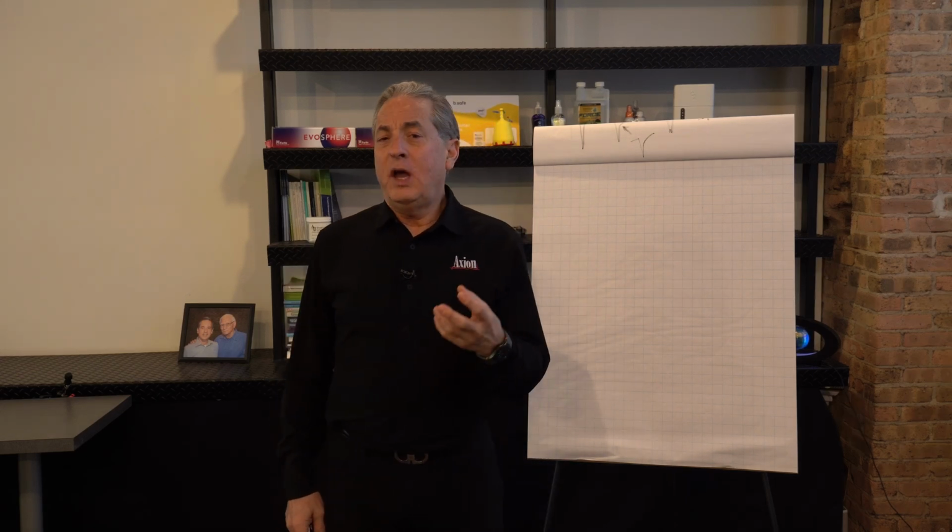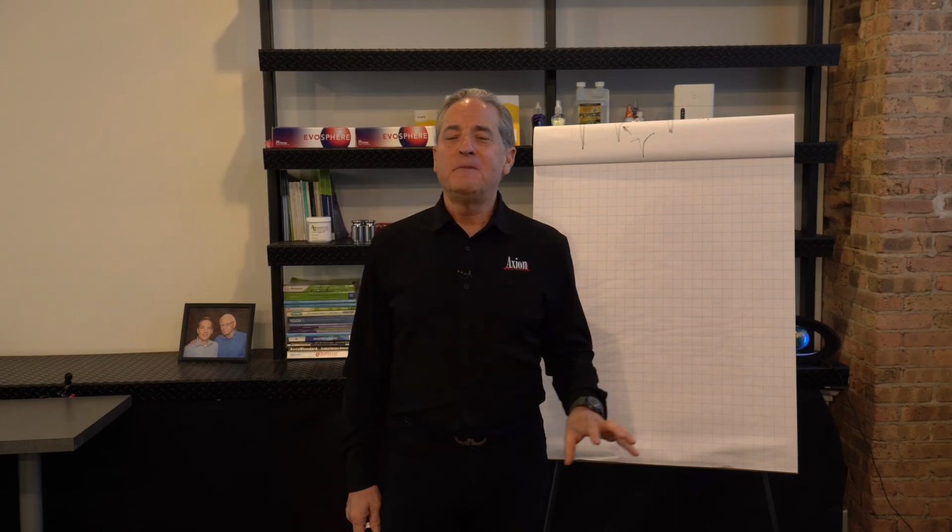So today we're going to do a deep dive into HPLC particles, and in this case we're going to look at the difference between superficially porous and totally porous material. Historically, since the beginning of time, since the beginning of HPLC, we've used totally porous material.